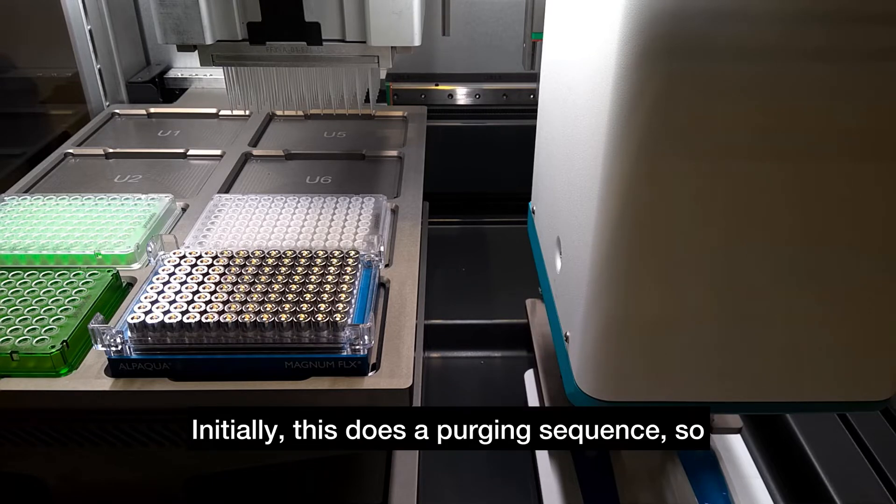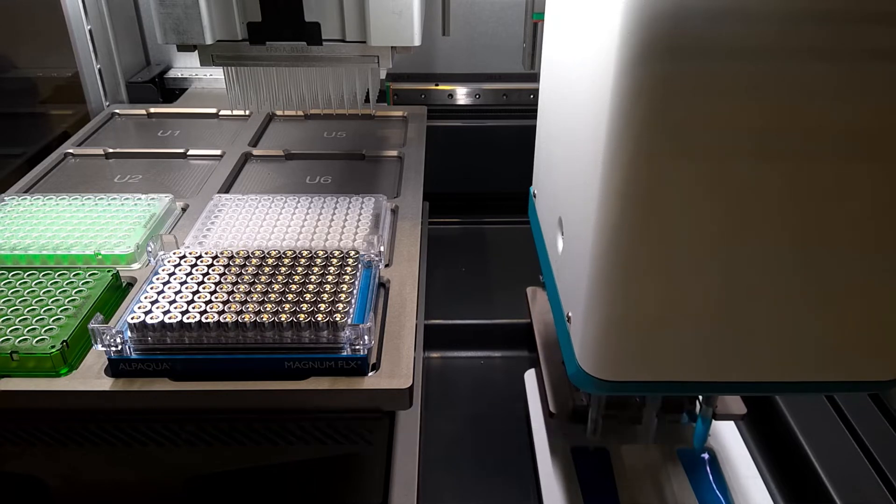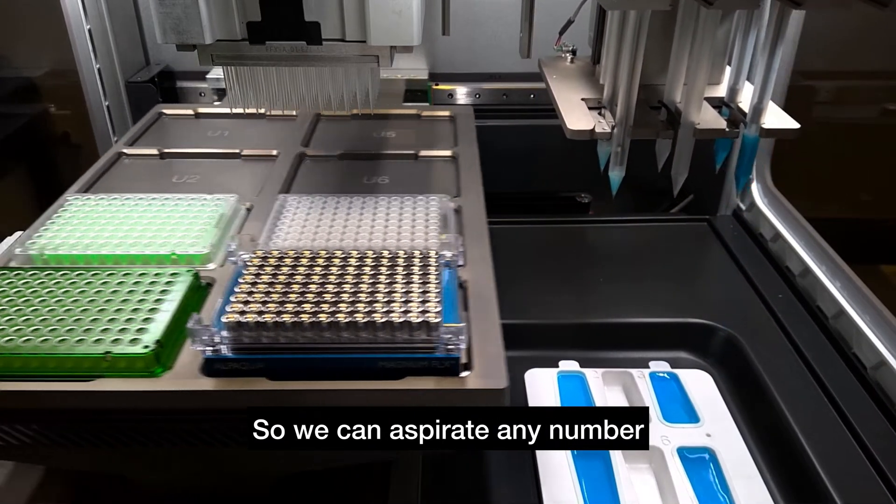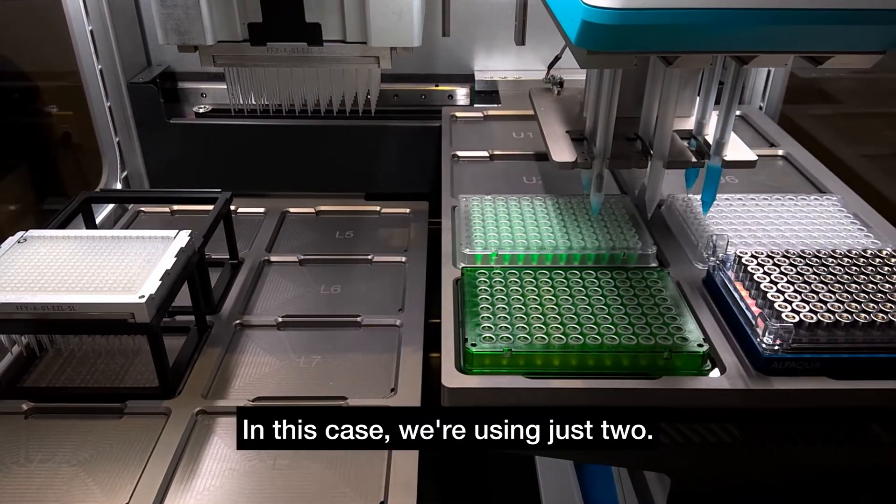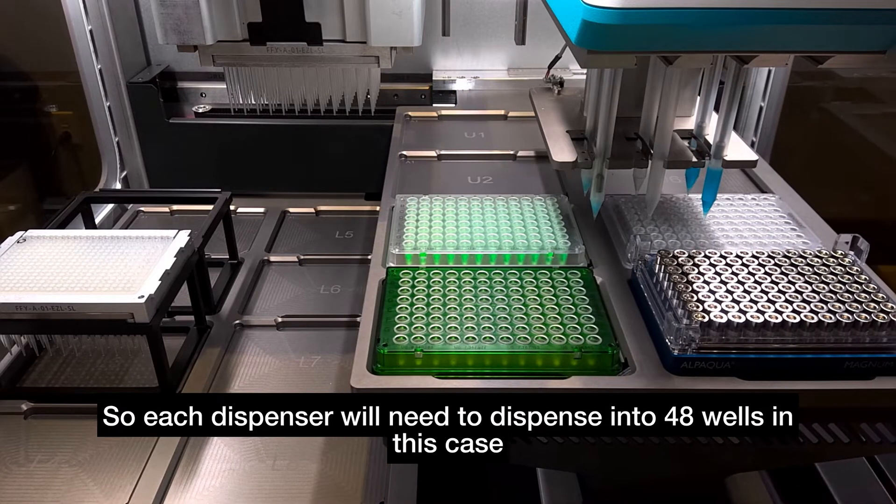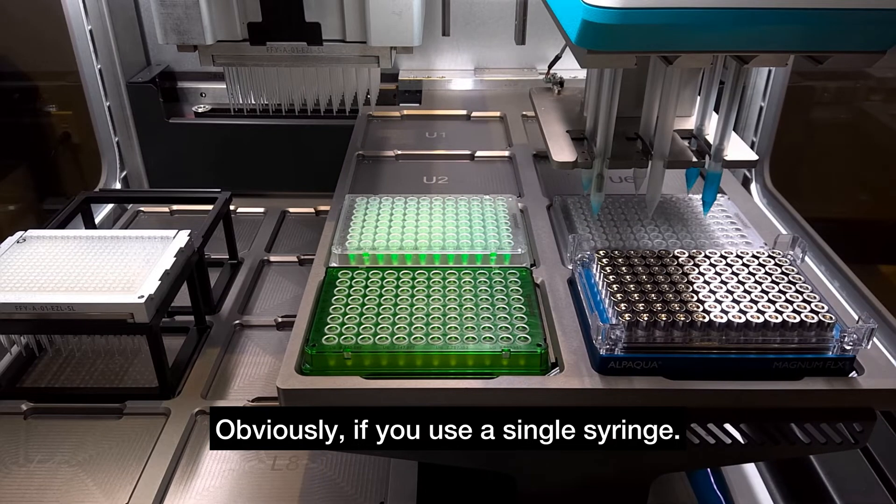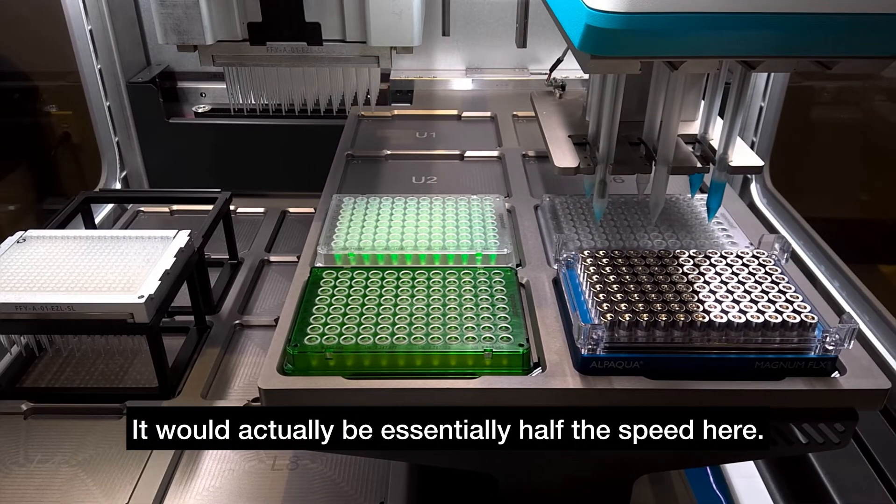Initially, this does a purging sequence, so it just ensures that there are no air bubbles in the dispense heads. And in this case, it's actually aspirated in two syringes. So we can aspirate in any number of syringes in this system. In this case, we're using just two, and it's working its way across the plate. So each dispenser will need to dispense into 48 wells in this case. Obviously, if you use a single syringe, it would actually be essentially half the speed here.